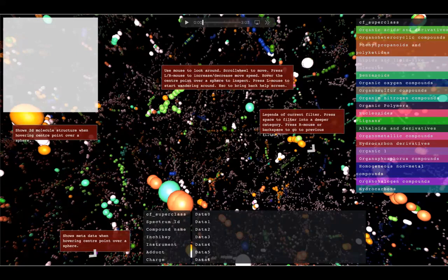And it was created by the Wonder Lab in Wageningen. Basically the students need to answer the question, can the computer learn chemistry from the mass spectra? Basically what I just asked you at the start, like, how can we assess that? Well, it's by mapping compound classes on the spectra.